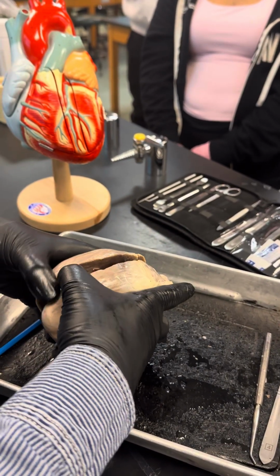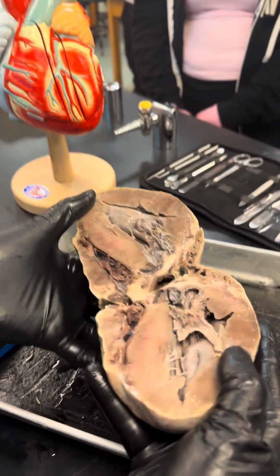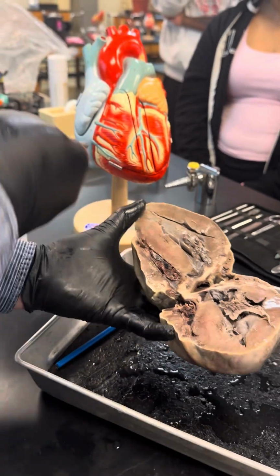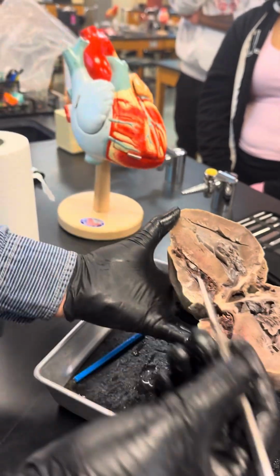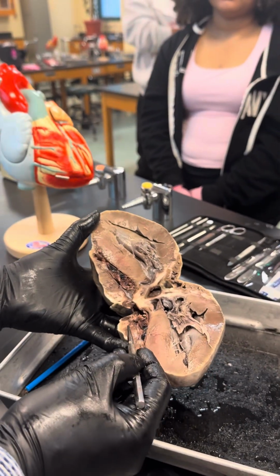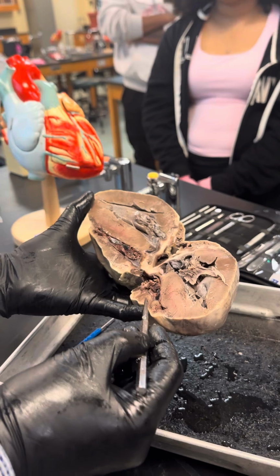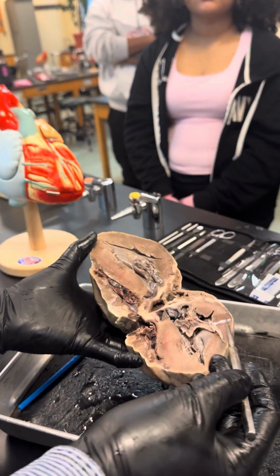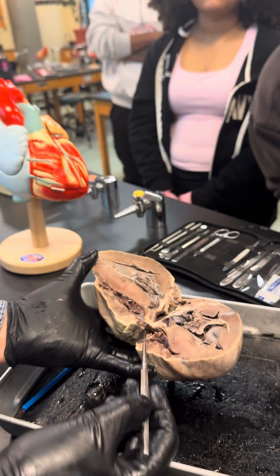So I've already dissected it. When you open it up, it looks like this. You can see here the right ventricle wall myocardium is thinner in comparison to the left ventricle. See, the left ventricle is thicker, the right ventricle is thinner.